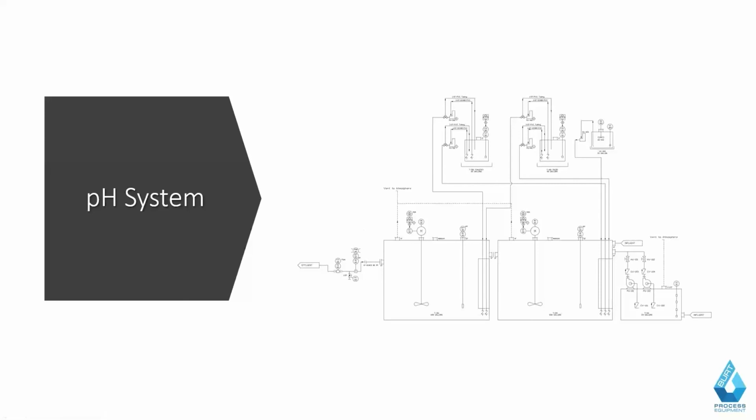And that's it. That's a simple rendition of how you go through any real life scenario and do the sizing for both a high purity water system as well as a pH system, which will then be utilized for a given lab space.